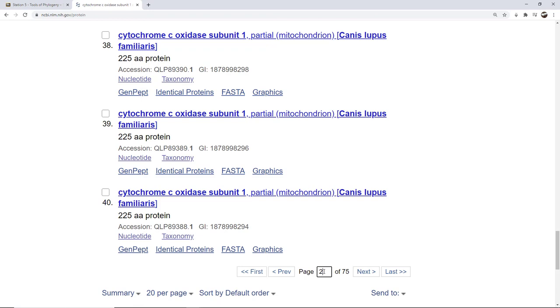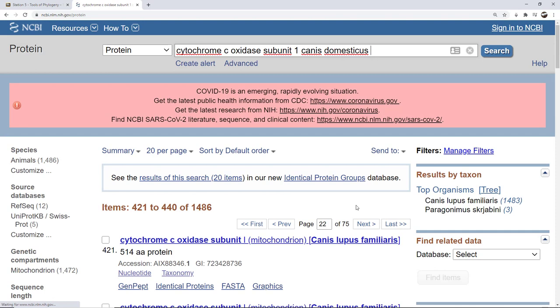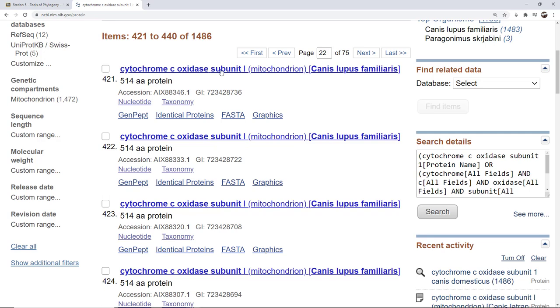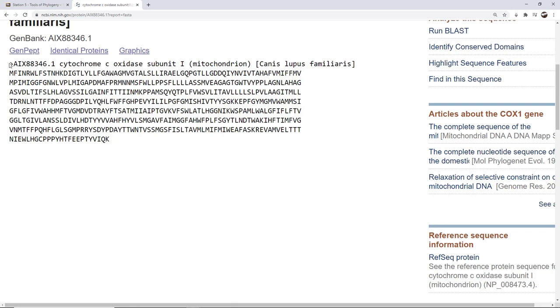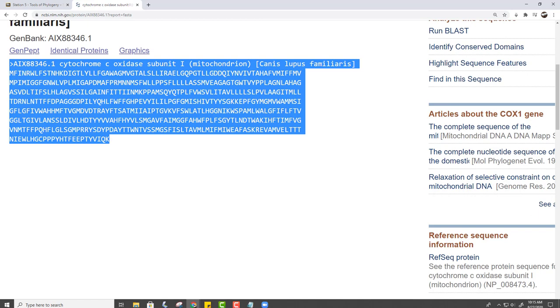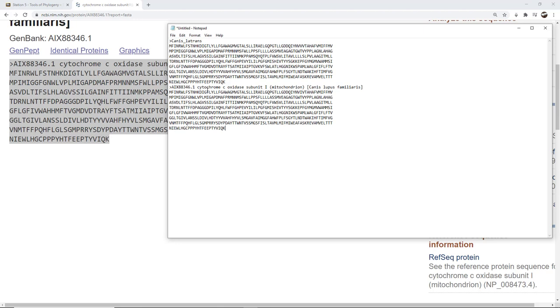I'm going to pick a random page — page 22. There's one: 514 amino acid protein, subunit 1, from the dog. I'm going to click on it. And without even going to the bottom I'm going to click on FASTA. There's my sequence. I'm going to copy it and then go to my Notepad and paste it. I'm going to edit the name of this: Canis_lupus_familiaris.